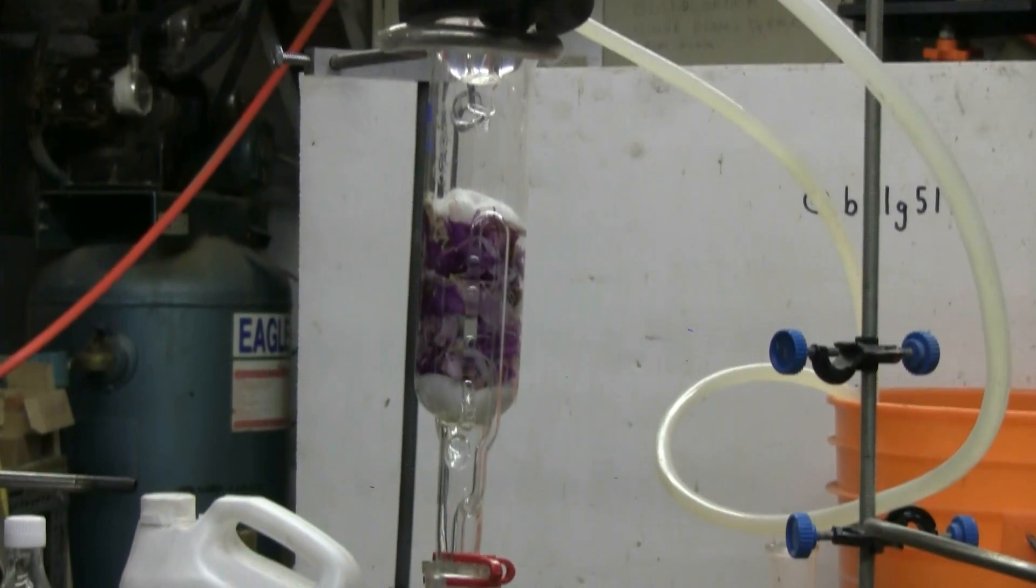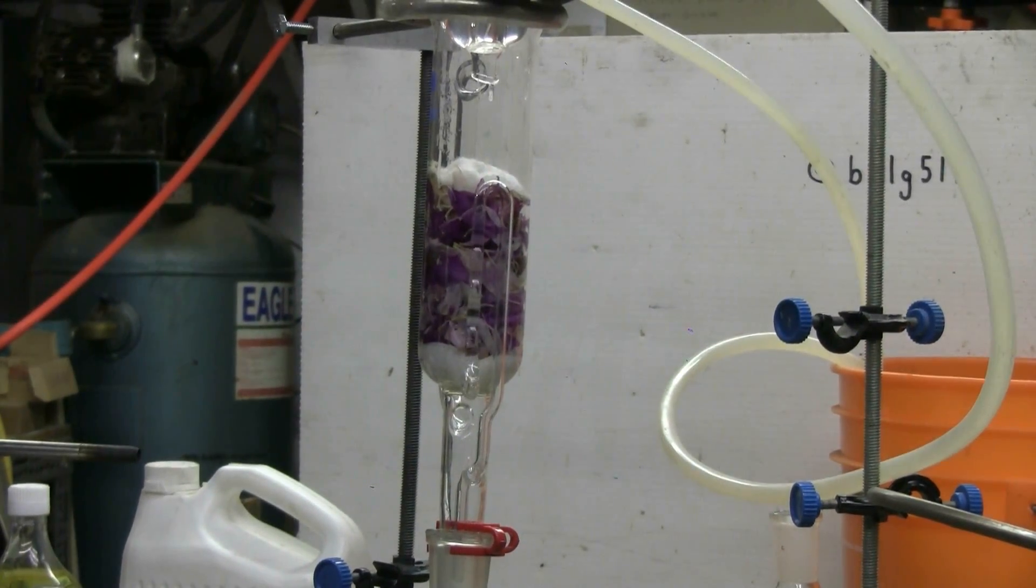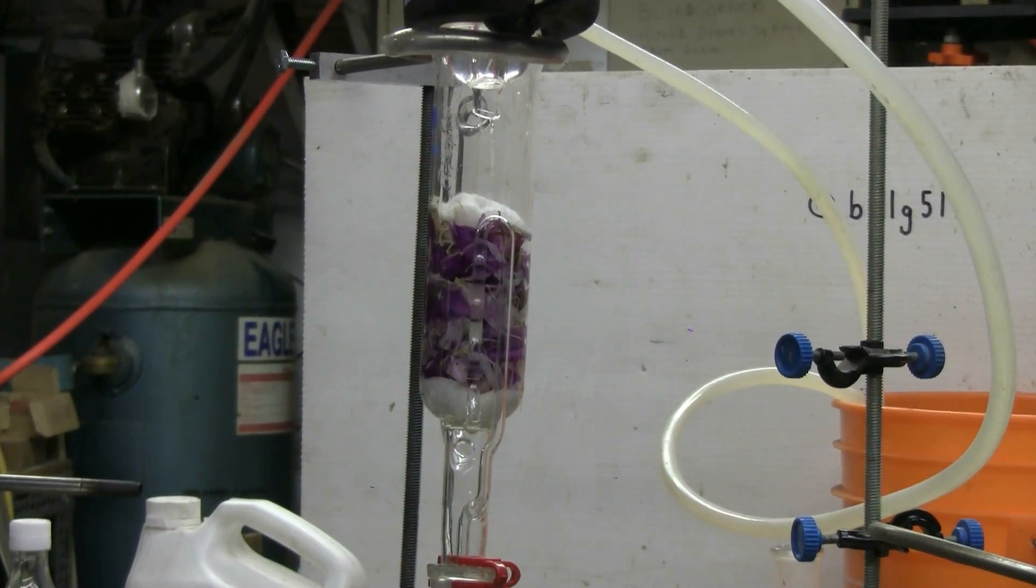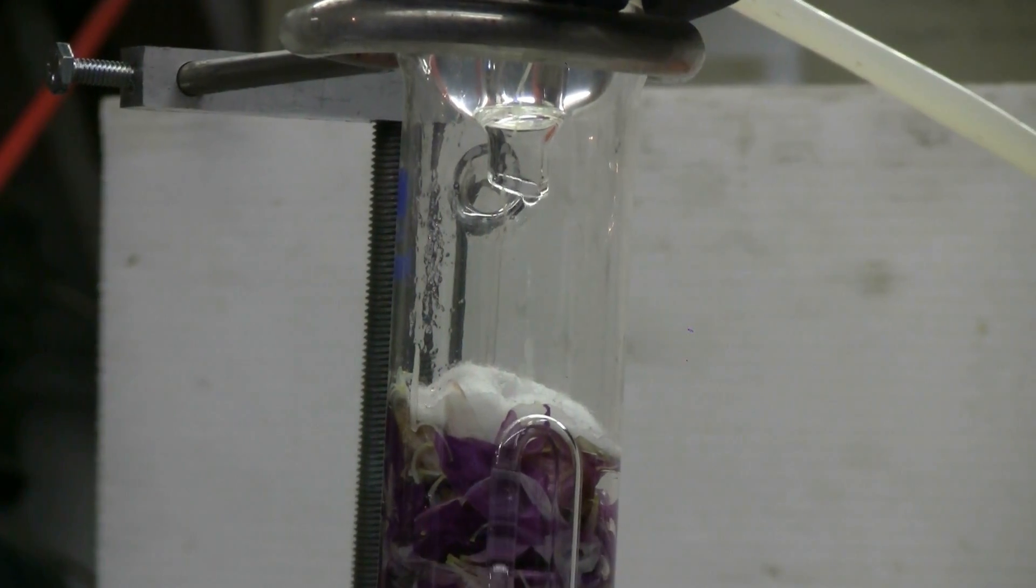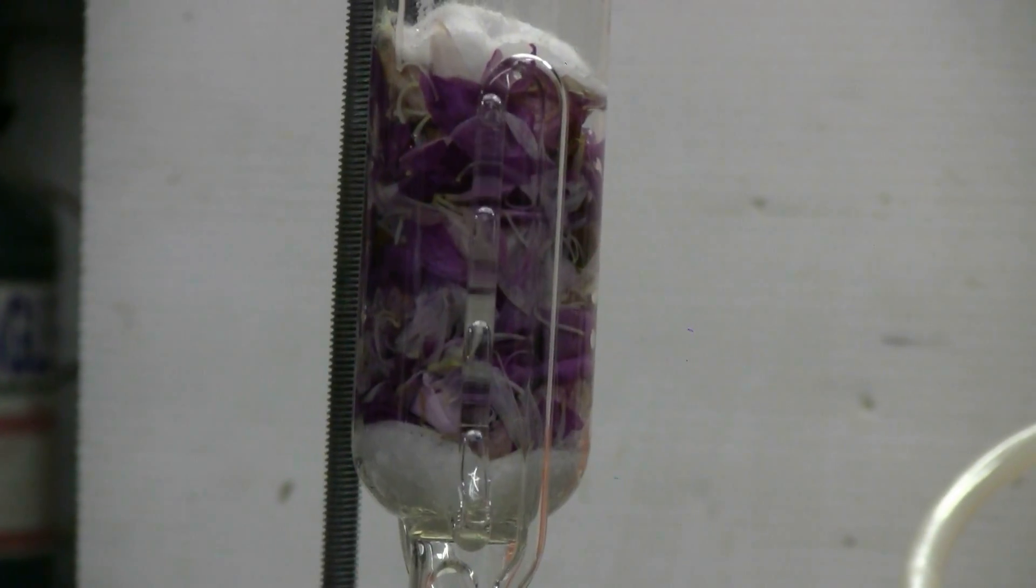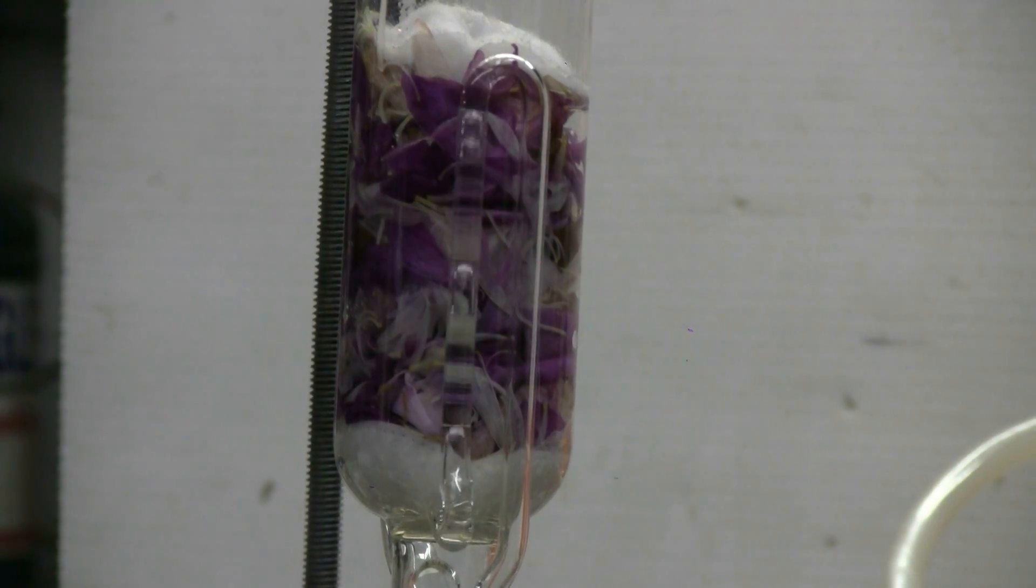The process is beginning its first cycle and we can see that ether is condensing in the Allihn condenser and dripping down into my Soxhlet chamber that contains a sample of these colorful peony flower petals.